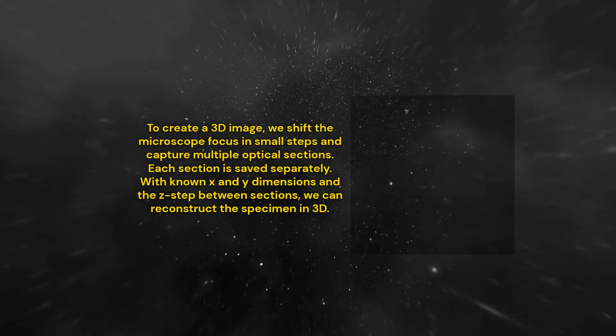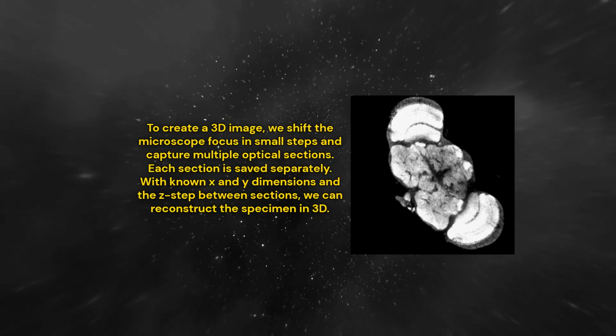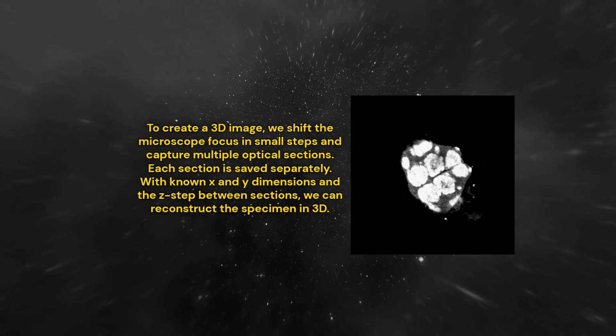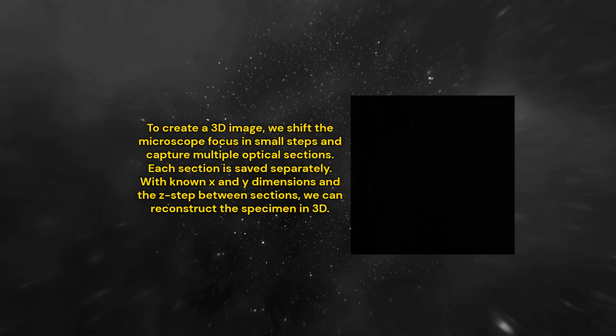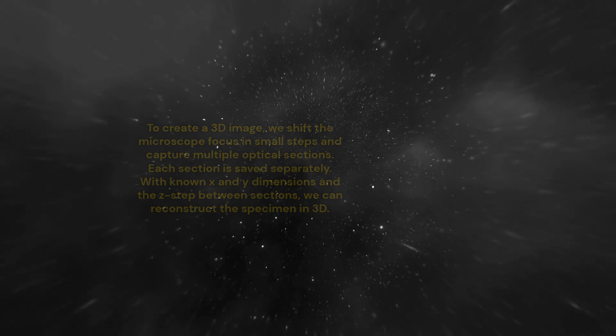To create a 3D image, we shift the microscope focus in small steps and capture multiple optical sections. Each section is saved separately. With known X and Y dimensions and the Z step between sections, we can reconstruct the specimen in 3D.